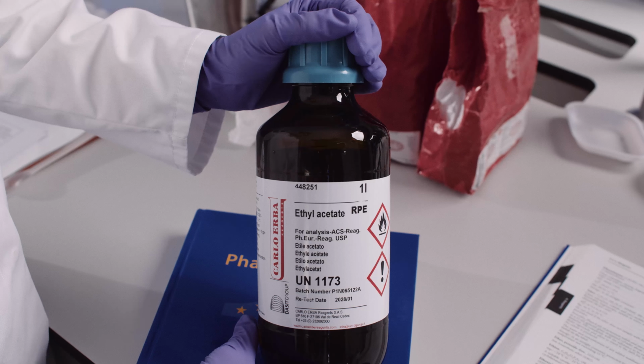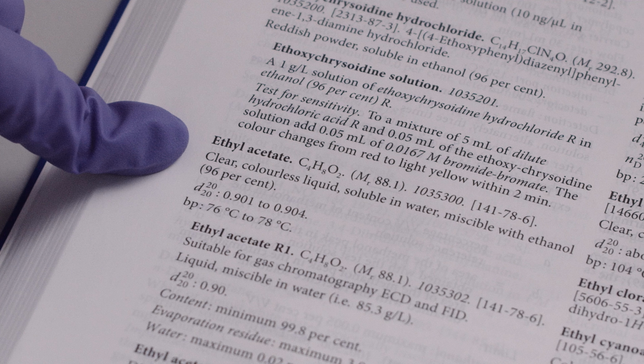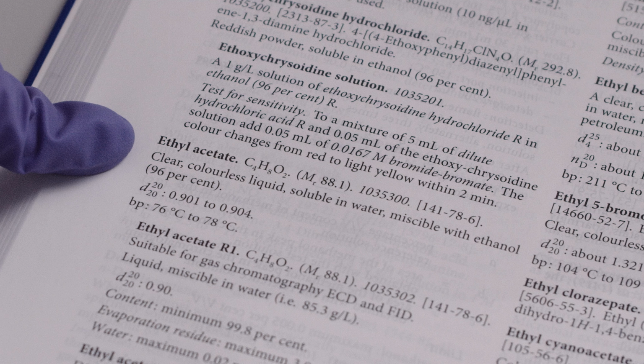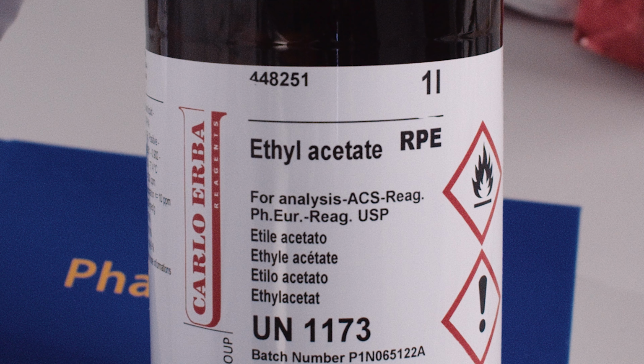As we can see, we need 2 grams of powdered herbal drug and 4 reagents for this test. They are identified by their R code. Learn how each of them is prepared in the Pharmacopoeia under the heading Reagents. Ethyl acetate in the reagent section directs us to the ethyl acetate monograph. It is described as a clear colorless liquid. We cannot prepare such a substance ourselves, but must buy it from a chemical supplier. We require ethyl acetate of pharmacopoeial quality, which guarantees that the chemical purchased has the listed properties.